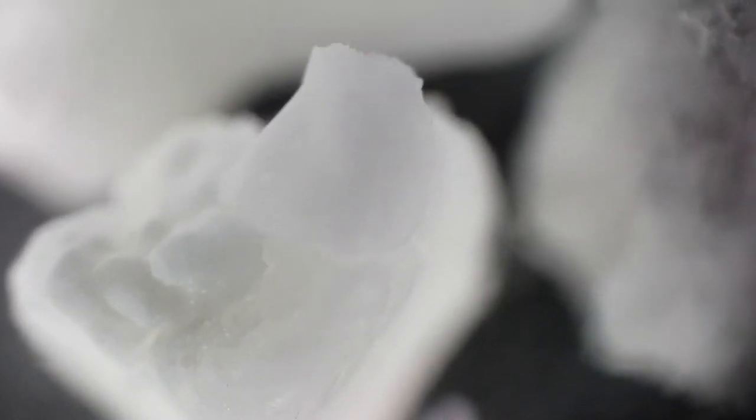This is really quite smooth but there's not a lot of definition. This is more glassy in a way, it's difficult to tell. There's so little definition there, looks a bit frosty there. You see that edge there just looks like a big frosty lump of snow really.